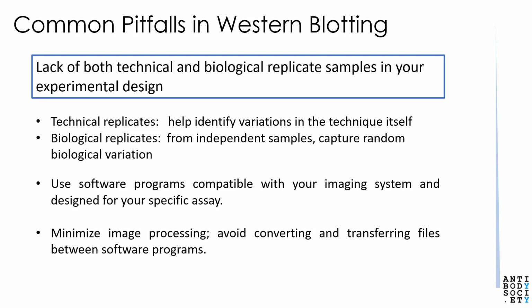We have seen that using software programs that are incompatible with your imaging system will give results that are different. So we suggest using software programs that are compatible for your imaging system. We suggest minimize image processing. If possible, do no image processing, because we have seen times where people do image processing and do converting of files, and that causes artifacts in the results. So lack of both technical and biological replicating sample in experimental design will result in less reproducibility of your results.